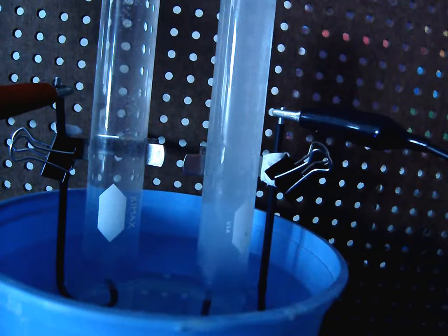So a couple things to consider here. It's very interesting that when hydrogen and oxygen are bonded together, when it's H2O and it forms water, at room temperature, H2O is a liquid. As soon as we break apart the hydrogens from the oxygens, the hydrogen and the oxygen at room temperature, when they're alone and unbonded to anything else, are gases. So we take the hydrogen and oxygen bonded together in its liquid state as water, and when they break apart, they turn into gases. It's really kind of fascinating. So that's what you're observing here, the collection of the gases.